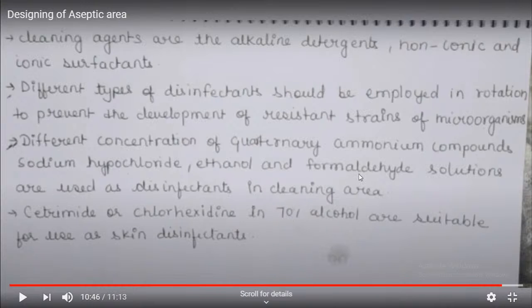Then, cleaning agents used to maintain the aseptic area are alkaline detergents and non-ionic and ionic surfactants. Different types of disinfectants should be employed in rotation to prevent the development of resistant strains of microorganisms. So this is all about the designing of the aseptic area.